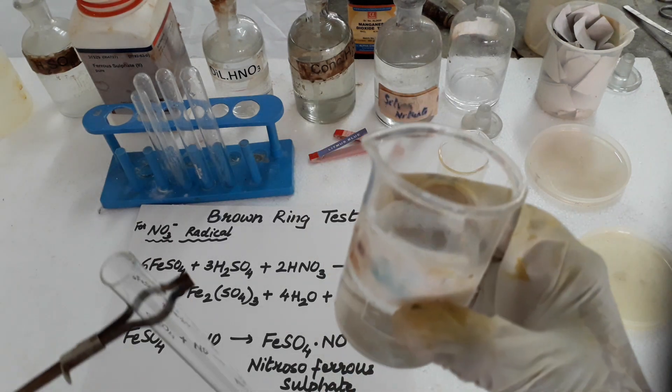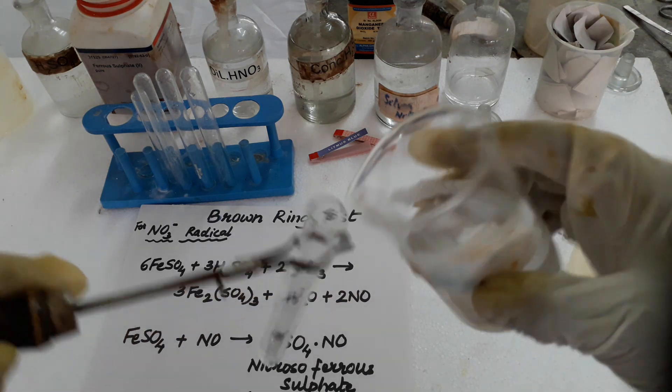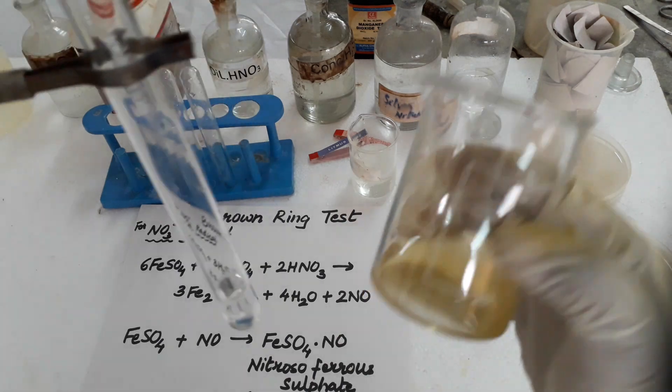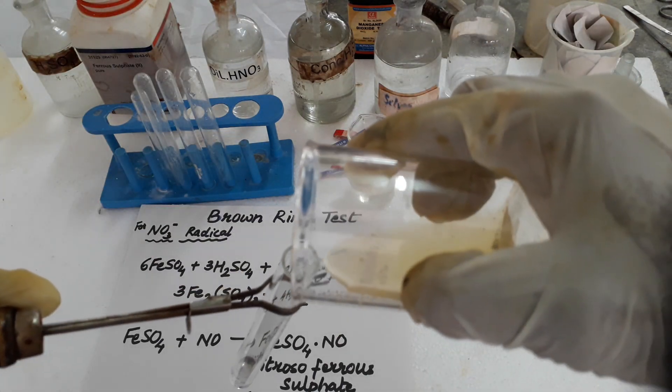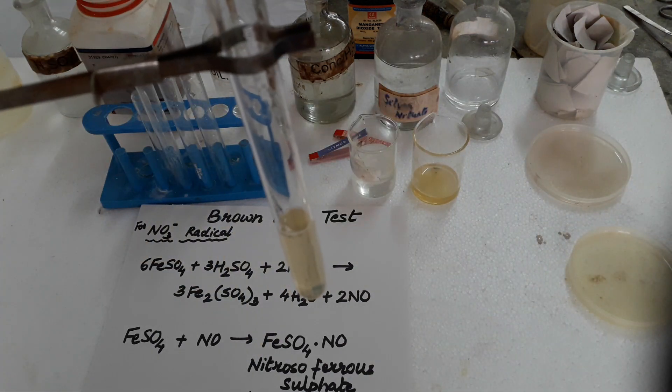For that I am taking here potassium nitrate solution in the test tube. I have taken potassium nitrate solution and then a freshly made ferrous sulfate solution is added to it — the same amount of freshly prepared ferrous sulfate solution is taken.